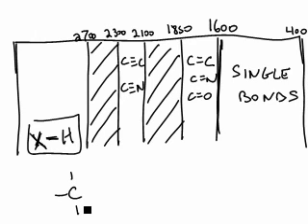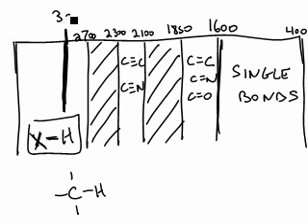A carbon with 4 bonds and a hydrogen on it is going to show up to the right of this line, which is 3000. So usually this region right here between 2700 and 3000 is going to be pretty busy with signals because of all of the CHs that are usually present in organic compounds.